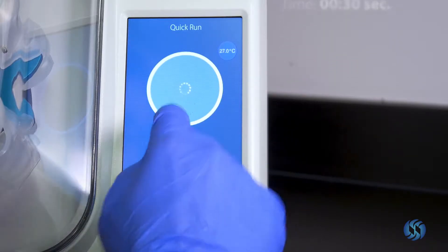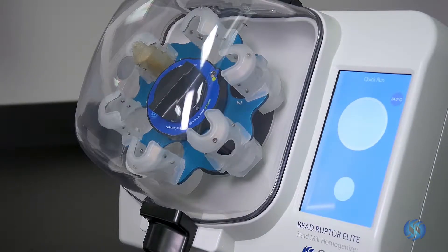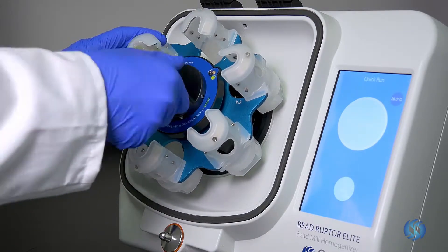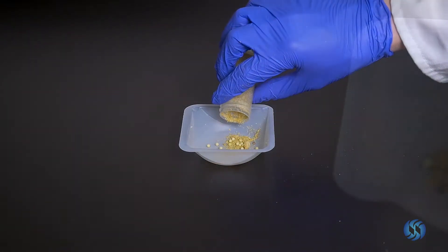Press Ready to begin the processing cycle. The Beadruptor Elite can process up to 6 samples in a single run when equipped with a 30 milliliter tube carriage. When processing is complete, remove the 30 milliliter tube from the Beadruptor Elite. Your cannabis sample is now ready for testing.